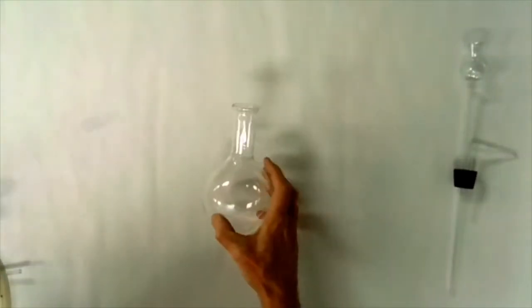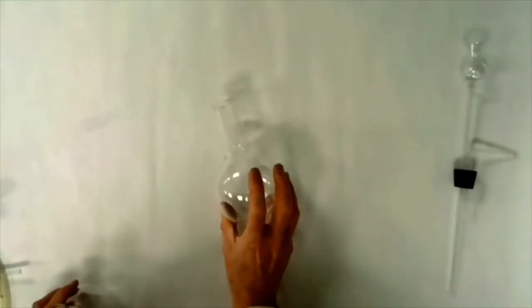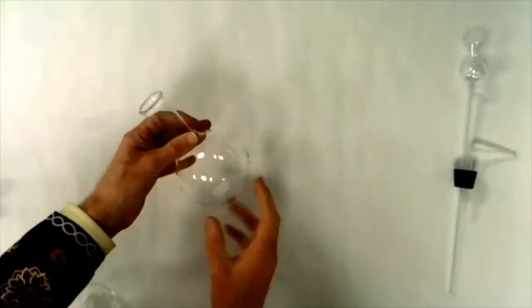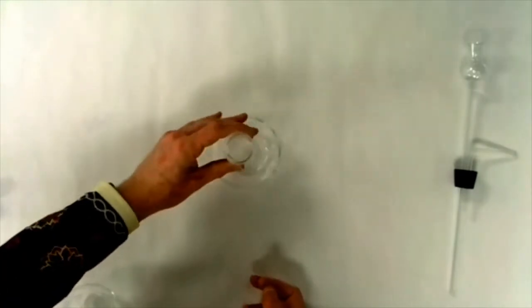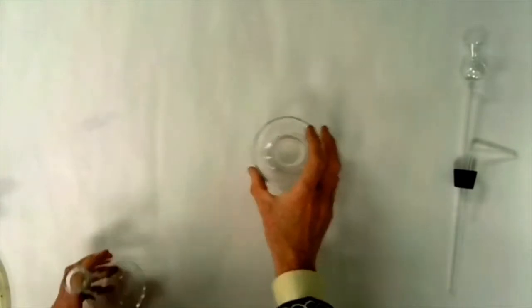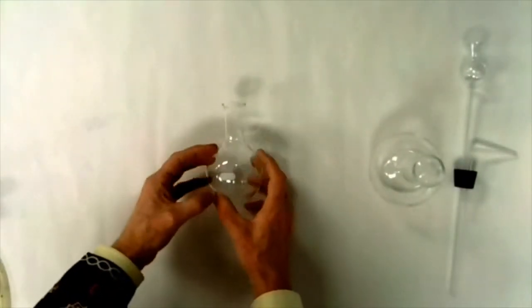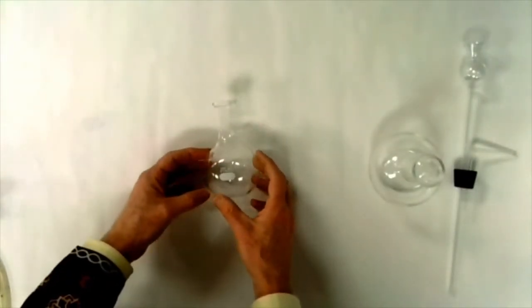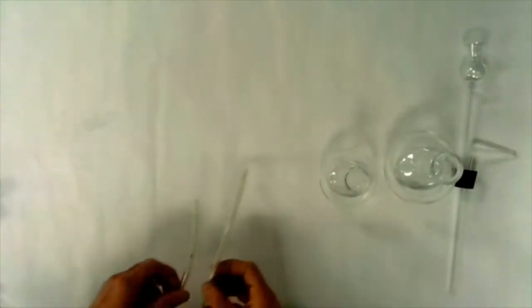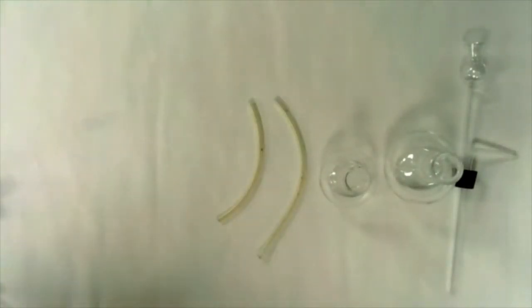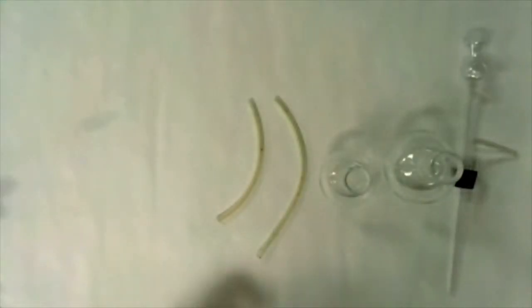We need a 500-milliliter Florence flask. A Florence flask is a round flask that's flat on the bottom so it can stand upright. A 250-milliliter Florence flask. Some pieces of tubing. This is kind of gross tubing, not very clean, but it'll work.